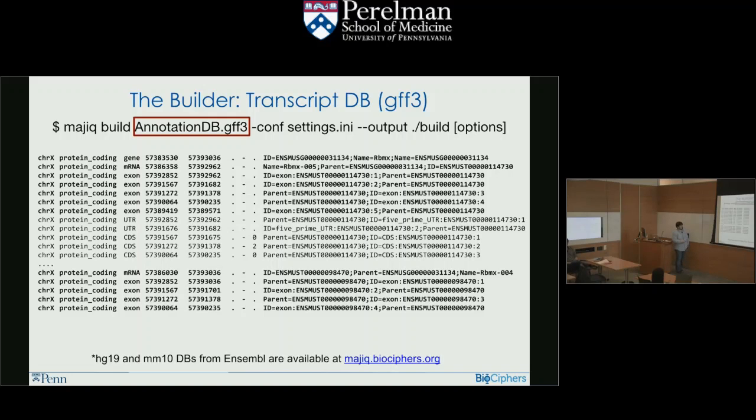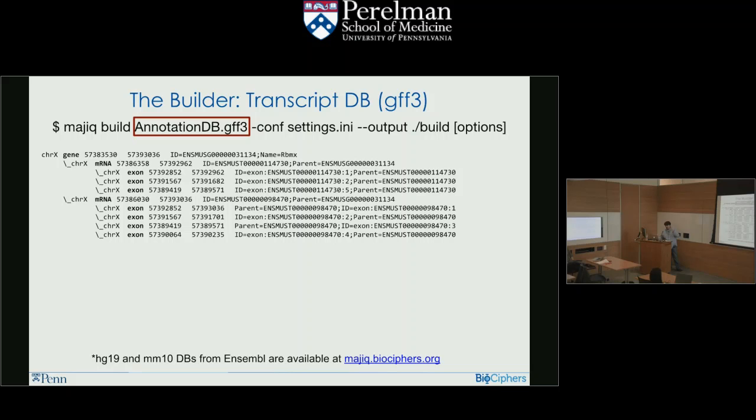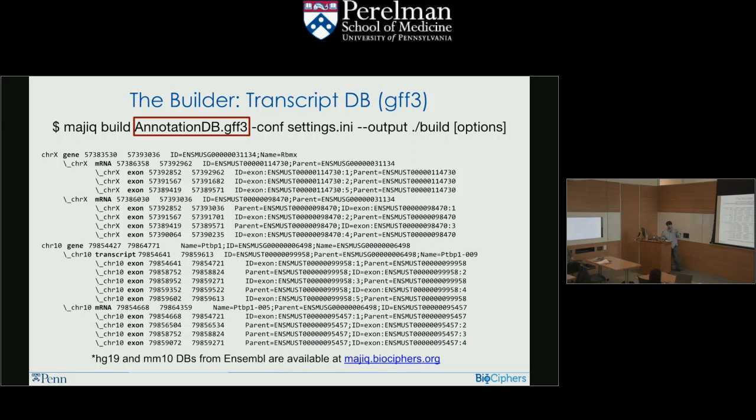Same thing for the coding sequence. For every exon, you'll have definitions of what the UTR is, or if it's coding sequence, where the stop and start codon is. This is all information that may be in your GFF3 file that we gloss over and don't pay attention to. So if you want to analyze things like that, you can tweak the GFF3 file to call it an exon, and that's what MAJIQ takes note of. Although, like I said, it should be redundant.